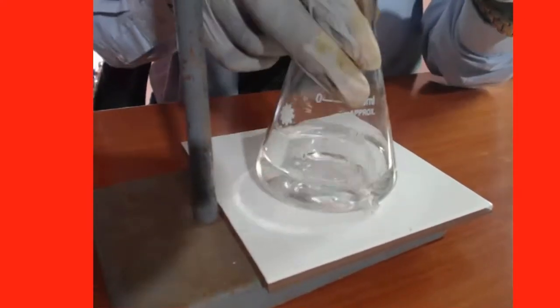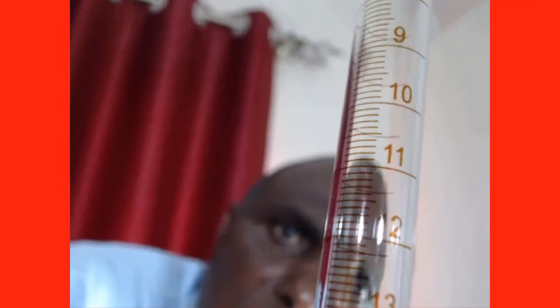Now it is colorless. It has turned from pink to colorless. This indicator, we call it phenolphthalein indicator. It is normally colorless in acids. Therefore, we have reached our end point.